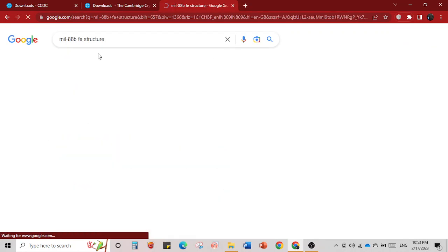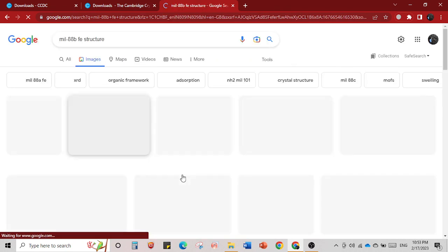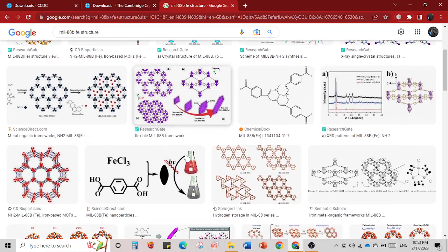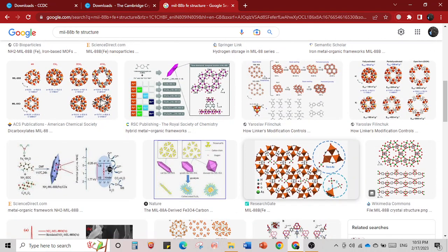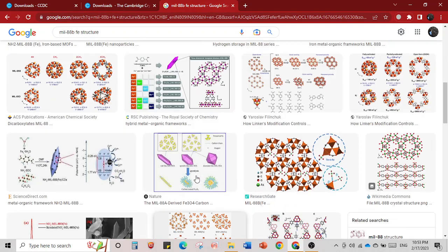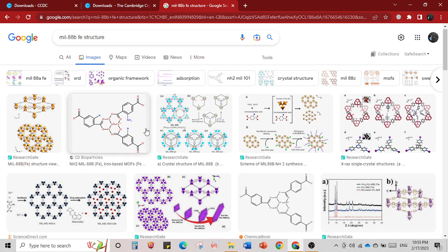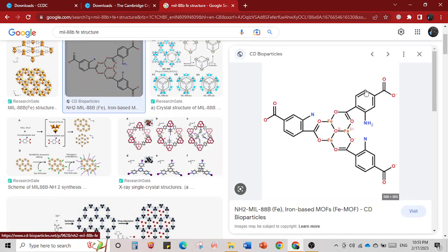If you take iron chloride and benzene dicarboxylic acid under different synthesis conditions, you will end up with MIL-88B. To understand the structure of MIL-88B: it has a structure where the metal center is linked to three other carboxylic acid groups. You can see that this is one carboxylic acid — it is an NH2-substituted benzene dicarboxylic carboxylic acid.